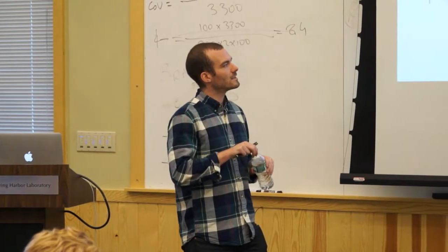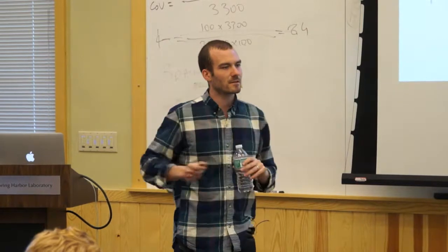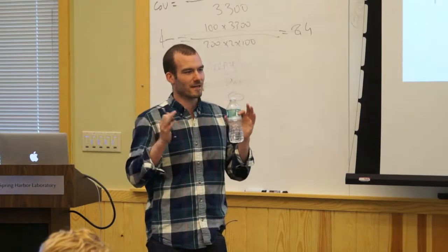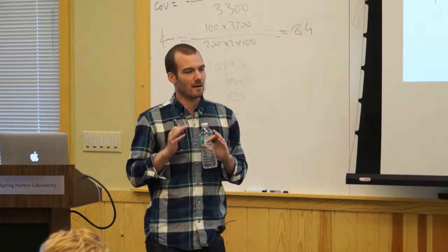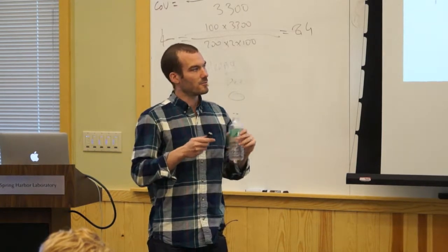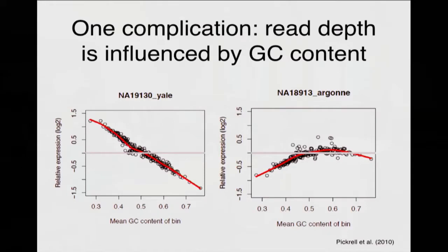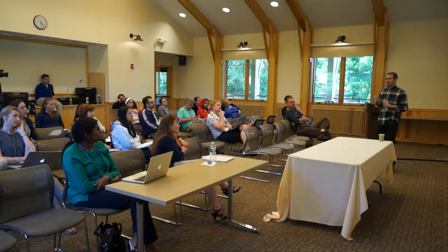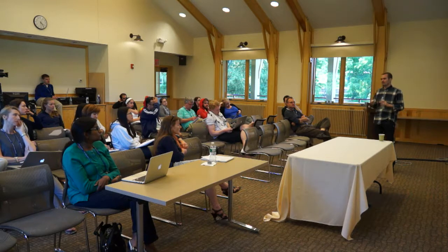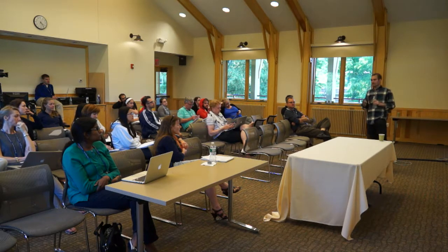My take on this is there's probably no way to get rid of an effect like this. If you really studied this effect, you could probably figure out ways to reduce it, but I'm going to guess it's never going to go away. Actually, these two things we sequenced at the quote unquote same concentration. But of course, anytime you sequence something at some concentration, there's some error, so they're not going to be sequenced at exactly the same concentration. My opinion is these sorts of effects will never go away. You just have to be aware of them and try to find them.